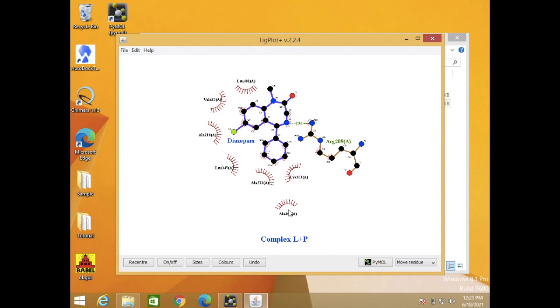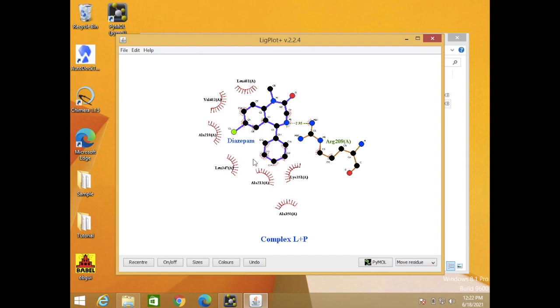Other amino acid residues here represent hydrophobic interactions. This residue is polar, so it might be Van der Waals interactions. If amino acid here has charge and our ligand also has a charge, ionic interaction will occur.